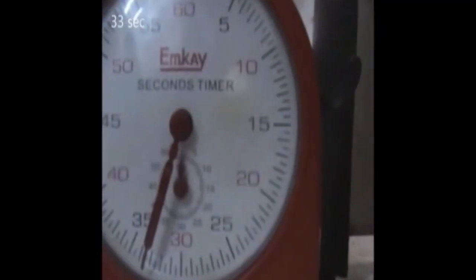Heating the lubricant till the thermometer says 60 degrees, we take another reading, 40 seconds this time. We repeat the procedure for 70 degrees and this time the glycerine takes 36 seconds to flow through the orifice. The last and final reading at 80 degrees gives us a time duration of 33 seconds.